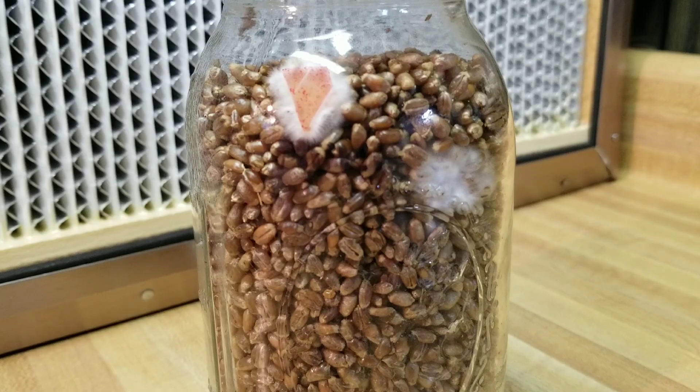It's been five days since I inoculated my jars. This is one of my agar jars and I wanted to show a close-up because the mycelium is really jumping off nicely - you can see that nice linear white mycelium jumping off those agar wedges into the grain. Agar jars are always going to take off before your LC jars, that's just the nature of it. From top to bottom our moisture balance looks really nice again - no more weird wet-looking grain kernels, everything looks nice and homogeneous.